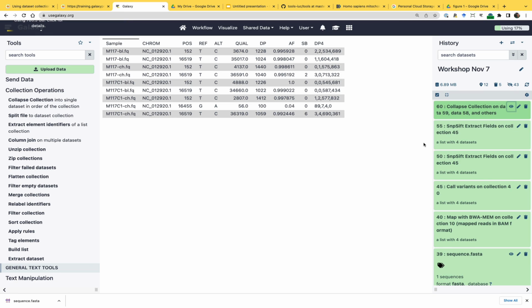We don't see actually. Well, we might have one variant with frequency of 4%, and that's actually probably a good variant, although not really. So, okay. I'm just looking at the frequency column here. So most of them are fixed. So most of them are 1s. 0.99 I would count as 1. So this one, maybe there is something there, and this is child cheek sample, so it's different tissue from blood.